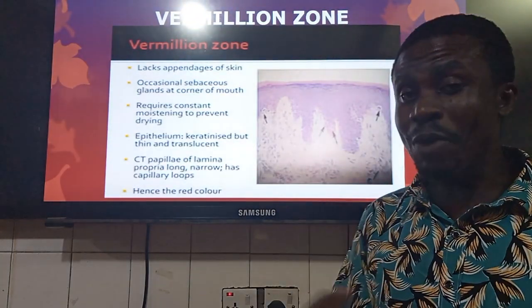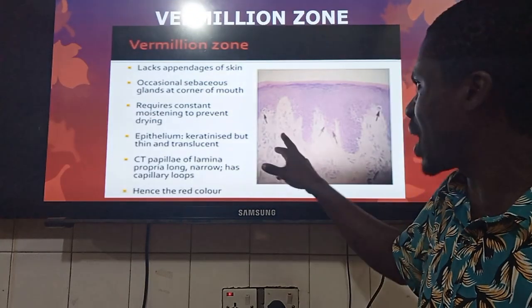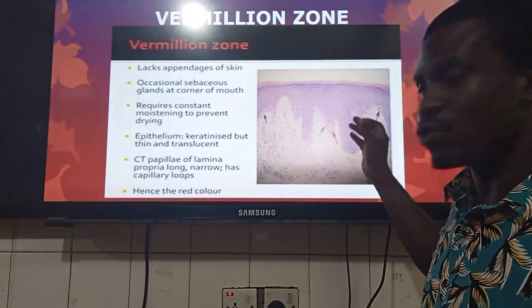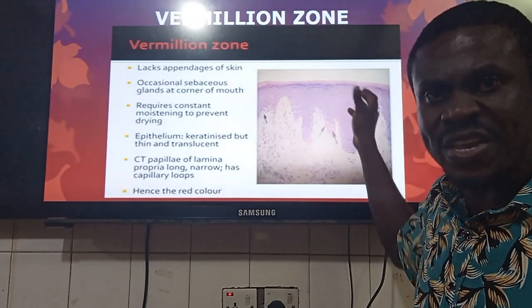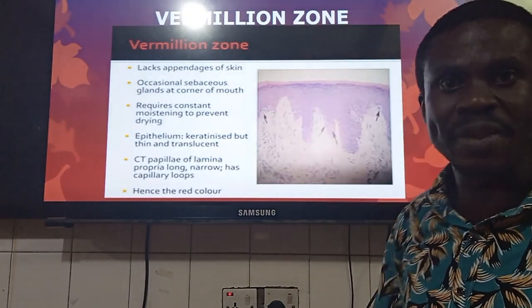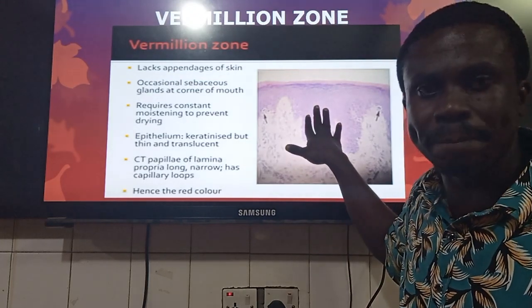And my friends, we know that connective tissue, unlike epithelial tissue, is well endowed with blood vessels. So we have capillary loops all around over here, so that nourishment will get to the epithelial cells via diffusion, and their waste will also be carried away from them, across the non-cellular basement membrane. So that's what we find over here.